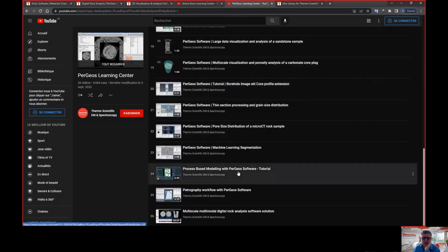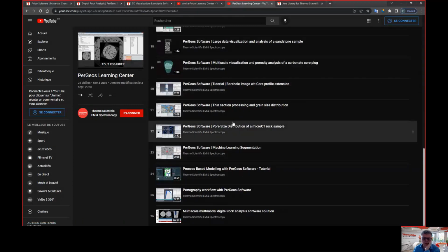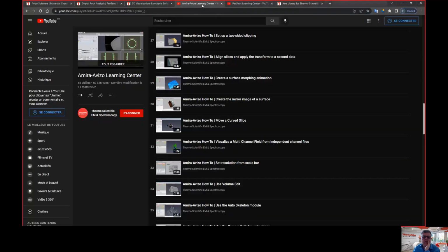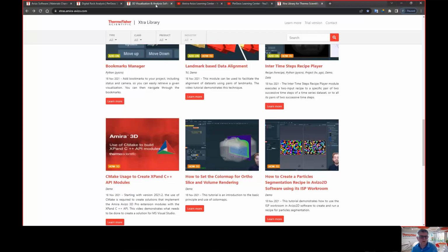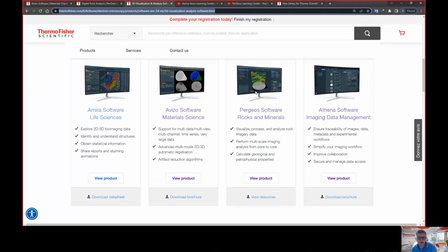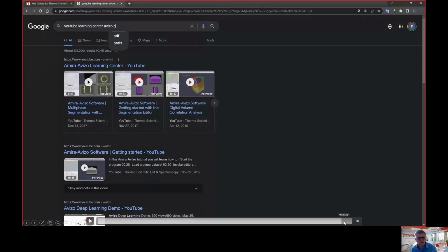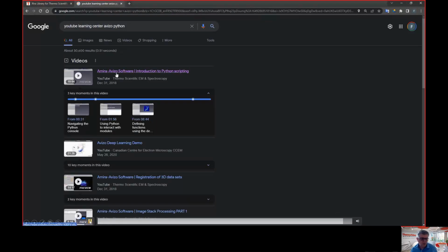Plenty of things. So I strongly suggest you look at the Xtra library. At the end of this tutorial, I will create a page with all these links, so you will get all these pointers. Okay, so you get the point. You have everything online. So indeed, there is one specific to Python that I really like.